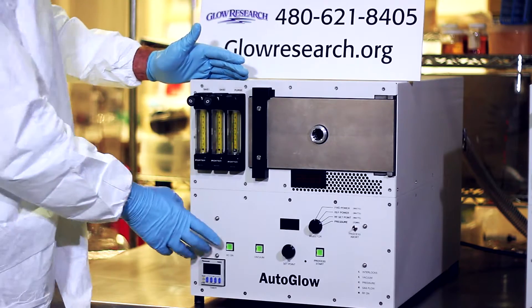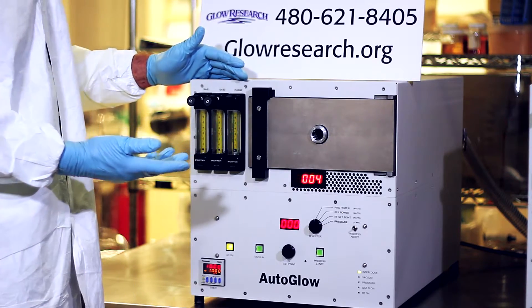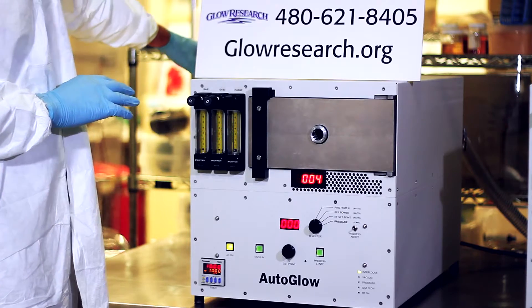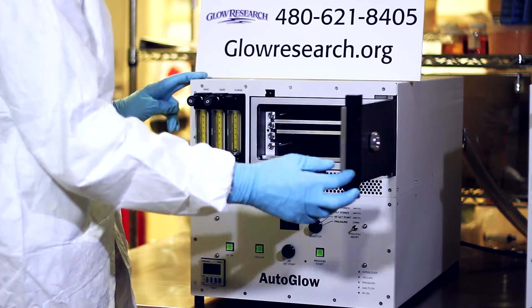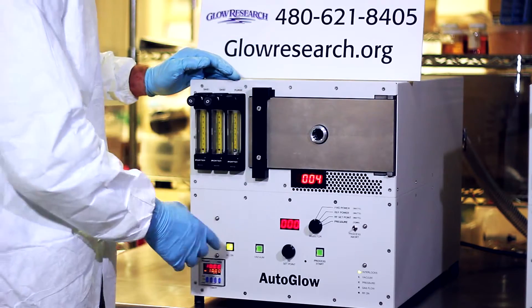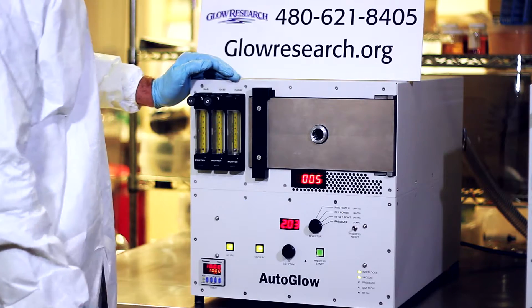Features of the Autoglow 200: the system can strike a plasma as low as 10 watts and the power can be adjusted in 1 watt increments up to 300 watts. The chamber is hard anodized for durability, which allows for the use of CF4 type gas. The chamber door has a dynamic hinge to prevent pinching of the door seal and to ensure vacuum integrity. Two flow meters can be used to meter process gas into the chamber.